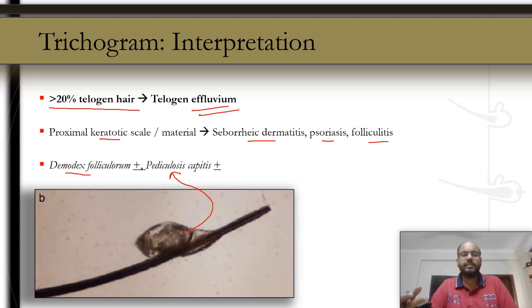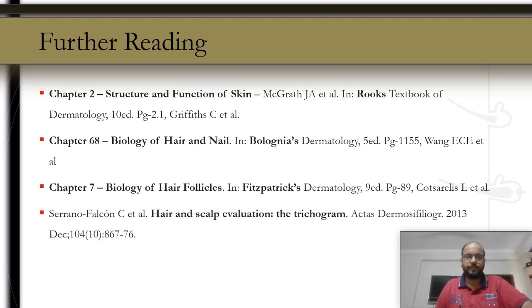So it becomes easier when you examine under the microscope and you can easily find the cause why the patient is very itchy. Clear? Let's move forward. So with that, we have completed our short introduction to trichogram. This half an hour will easily teach you the basics of trichogram and how to interpret it. If you want to read more, these are the reading recommendations.